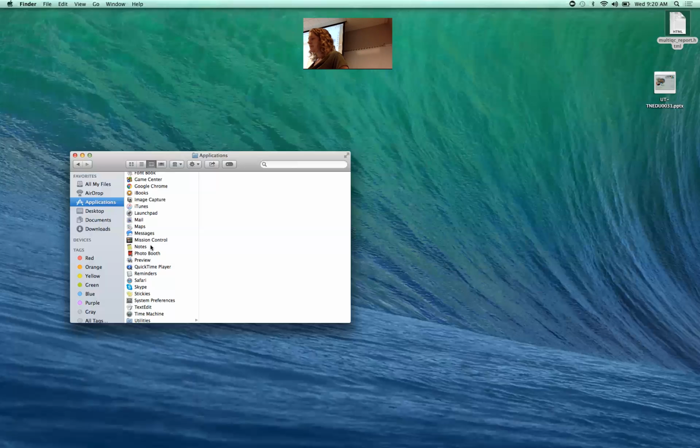For the percentage of duplicates, that's the first column. The second column, what's the duplicate exactly? What percentage of reads are highly duplicated? A lot of times it's the same gene. If you have a couple of genes that are really, really highly expressed, you're going to sample those genes a lot, and then those reads look like they're duplicates. In a DNA sequencing experiment, this would usually be an indication that not enough DNA went into the library prep, and your PCR created a lack of complexity in your library.